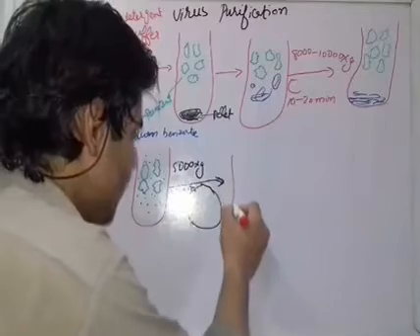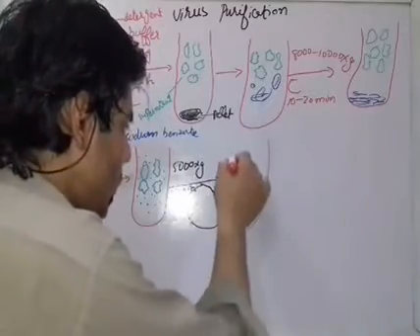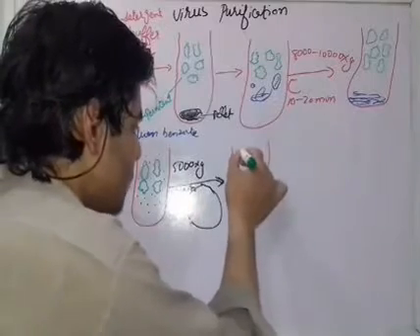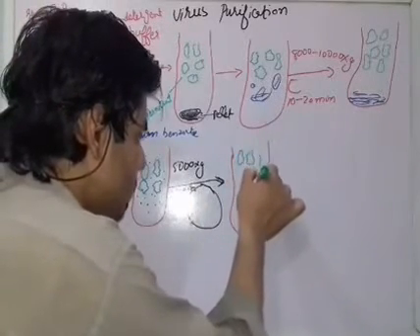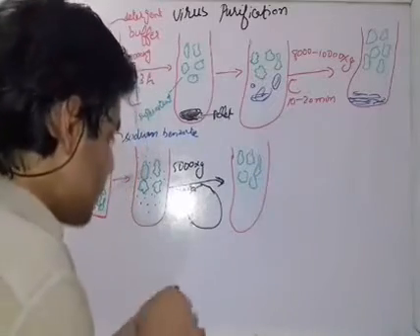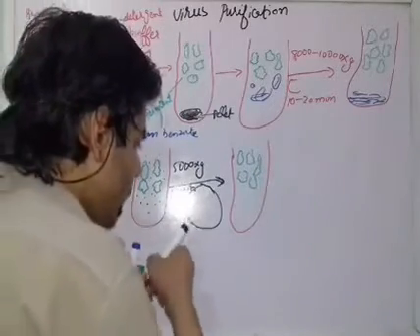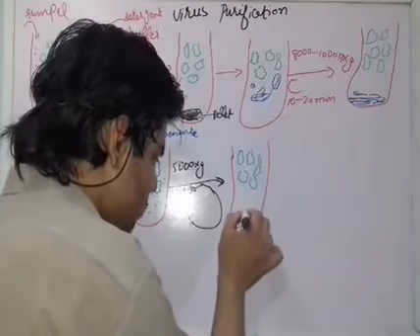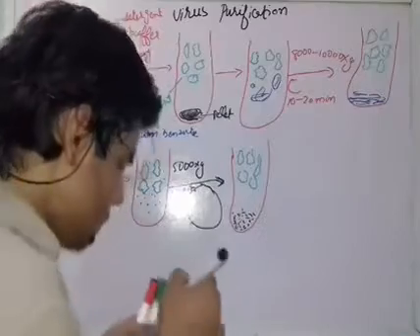Once again we get the supernatant, meaning the virus is in a supernatant form, and the sodium benzoate is now in a precipitation form, or debris.